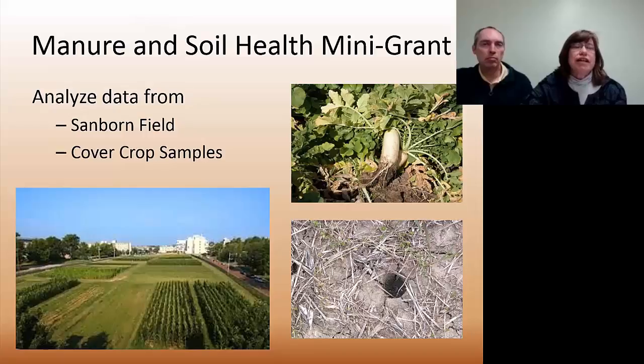And eventually we would like to put the samples categorized as to major land resource areas, so we can tie it back even more closely to the soils. And that's where we are right now. We hope to have a lot more information as we have analyzed the samples and made the comparisons.